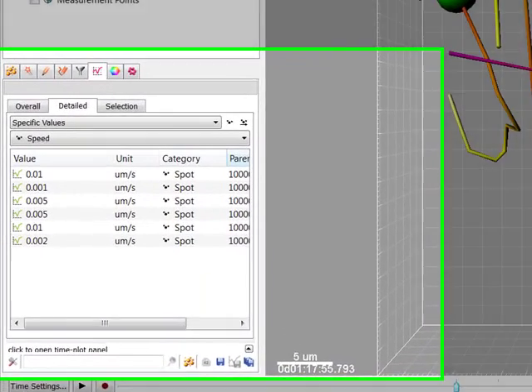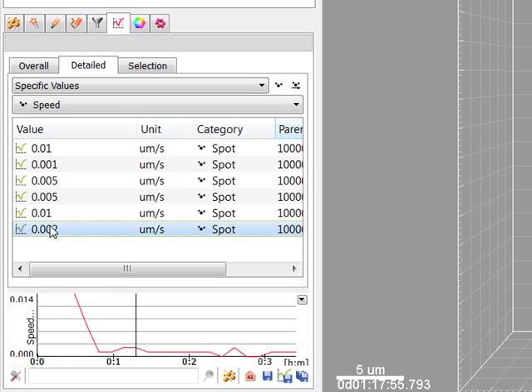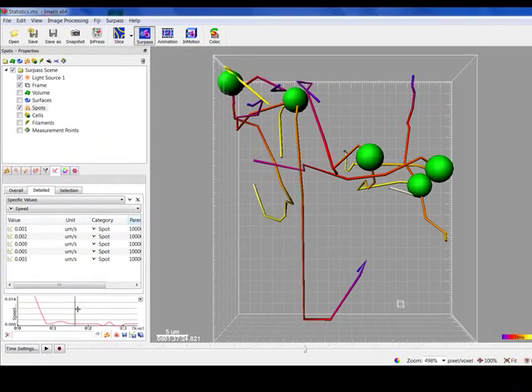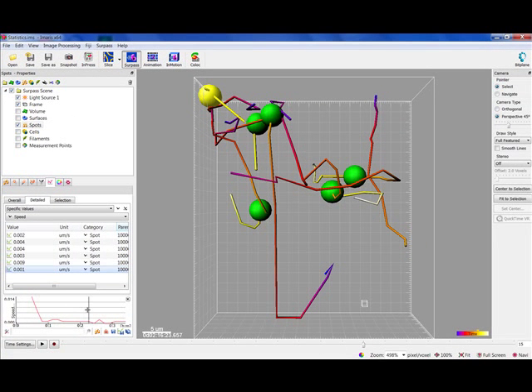Selecting a variable that changes over time creates a time plot. The current time point is indicated with a black vertical line. Clicking inside the plot moves the timeline. Moving the timeline changes the variable value and the image accordingly.